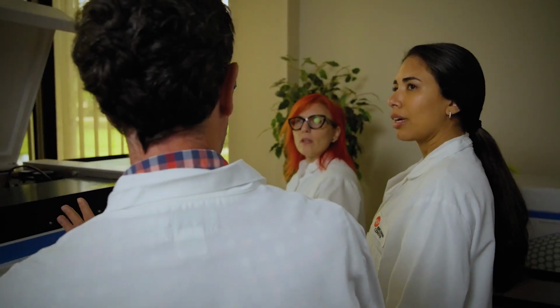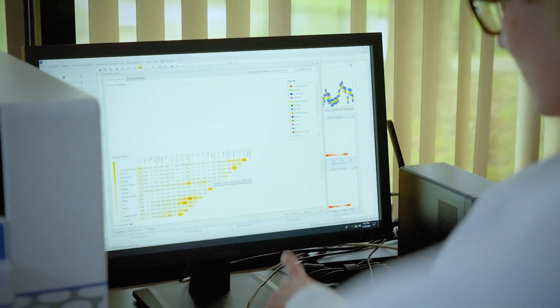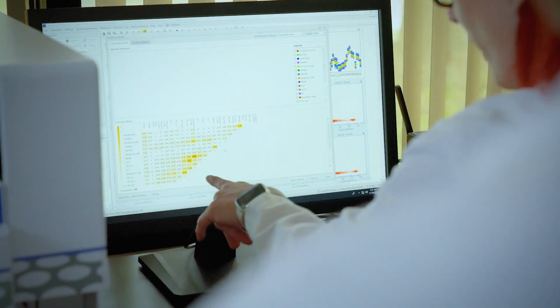The CytoFLEX Mosaic is designed with the user in mind. Like other CytoFLEX family members, it simplifies flow cytometry, and in this case, the transition to spectral for both existing and new users. Coming from a background in managing a core facility, I find one of the strongest aspects of the CytoFLEX Mosaic module to be the CytExpert software. With the same base software, transitioning from a conventional flow cytometer to spectral becomes seamless for CytoFLEX users. There's no need to learn new software or switch instruments.